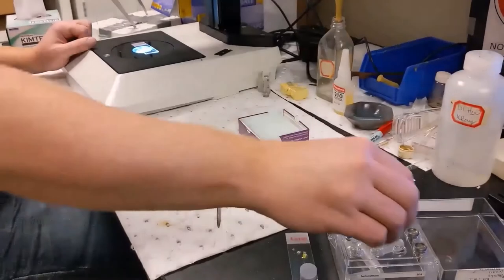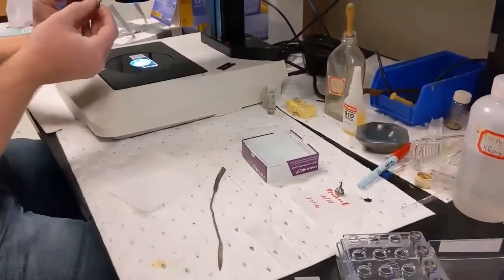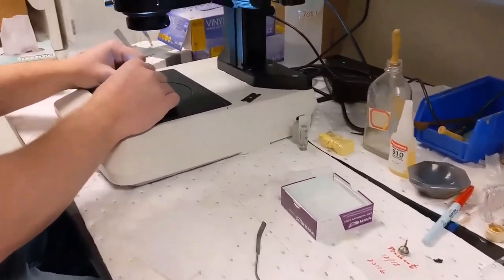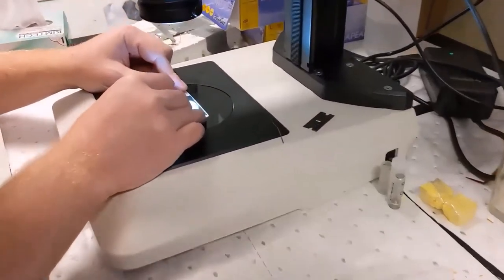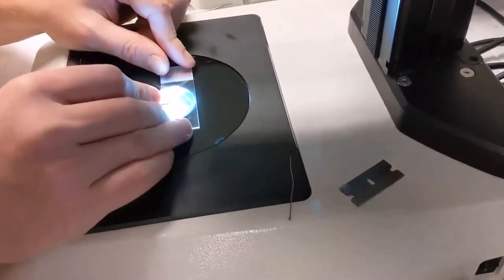While using the microscope eyepieces, we will try to scoop the crystal up onto the very top of the micromount. Be careful not to press the mount into the slide too hard or you risk damaging the flexible plastic tip. Picking up a crystal on the mount is a skill that requires patience and a lot of practice.